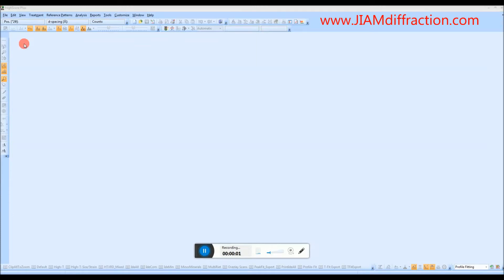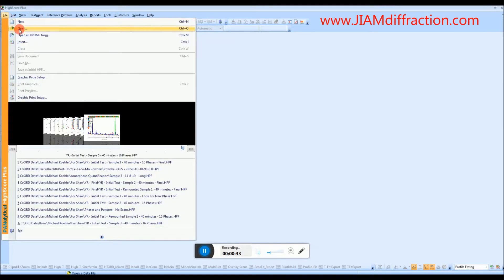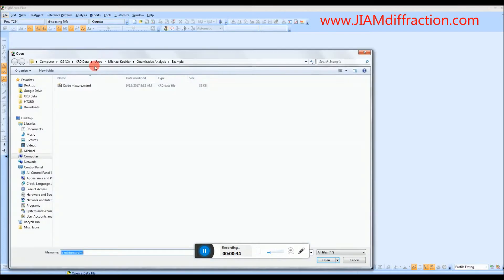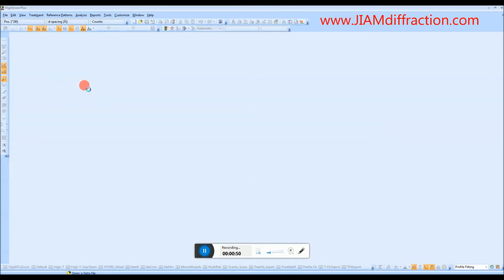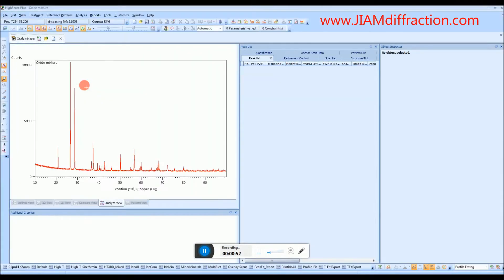Hello, my name is Michael Koehler and I am the lab manager for the JIAM diffraction facility located at the University of Tennessee Knoxville. This video will cover how to use HighScore Plus to identify the phases in a sample. The first step in phase identification is to load a data file. To do this we need to go to File, Open. Let's open it and we see our data in red.